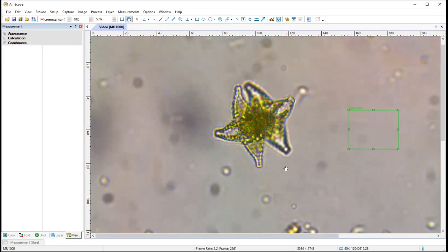But you'll want to practice this for a bit. It's going to take some time to get used to. It's probably going to take you more time than you think to get one good picture or a couple good pictures of a single specimen. That's completely normal. So take your time and take pictures, save them under informative names, crop them so that they don't take up gigabytes of space, and then you'll be able to upload them to the database.